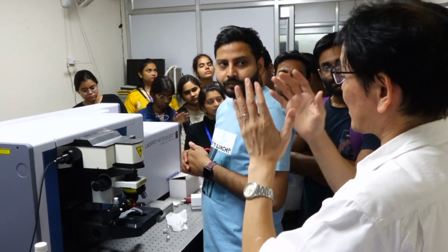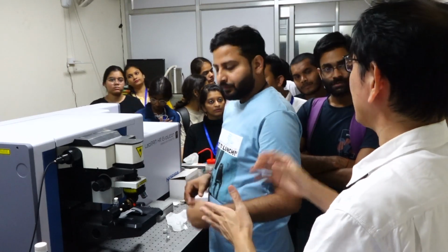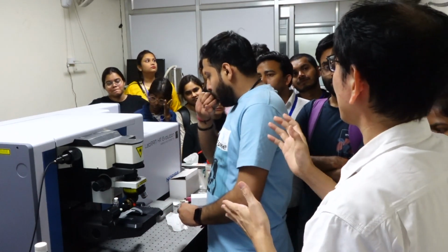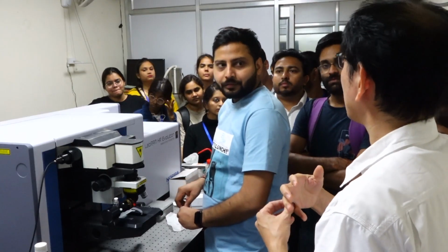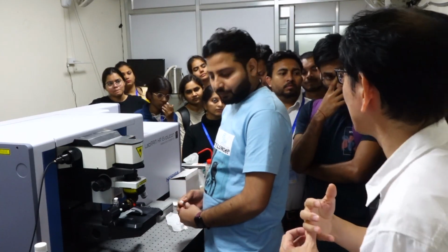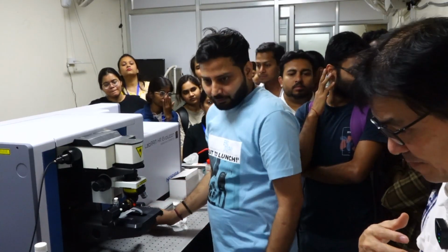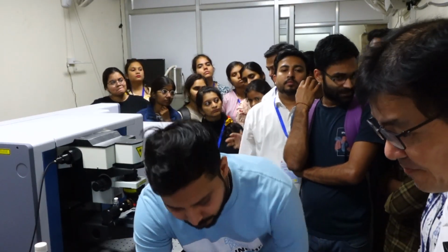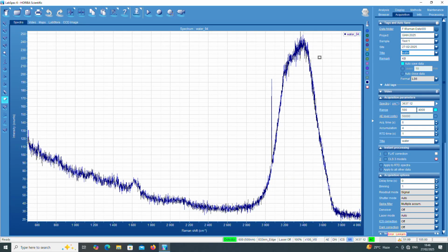Put a grating and set the digital camera instead of the CCD detector, and it is possible to record by taking photos. Everything else is the same.